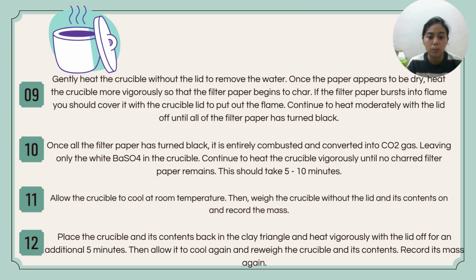Continue to heat the crucible vigorously until no charred filter paper remains. This should take about 5 to 10 minutes. Then allow the crucible to cool at room temperature. Then weigh the crucible without the lid, with its contents, and record the mass.